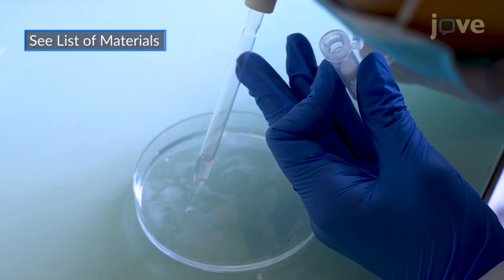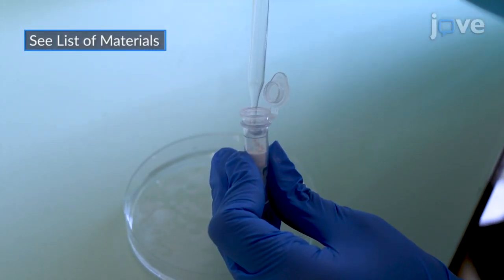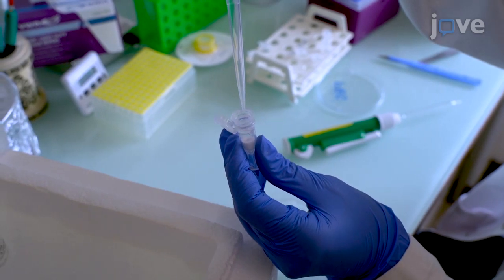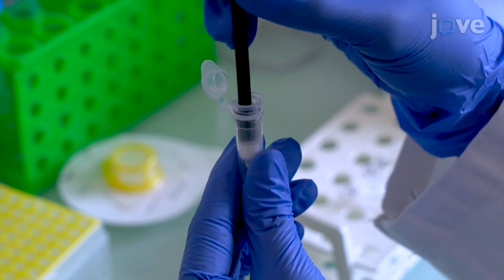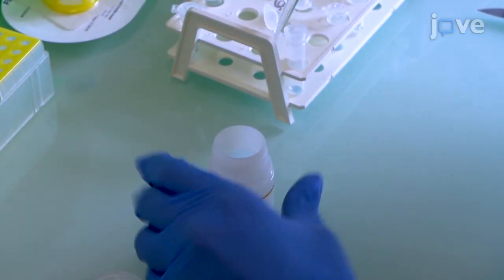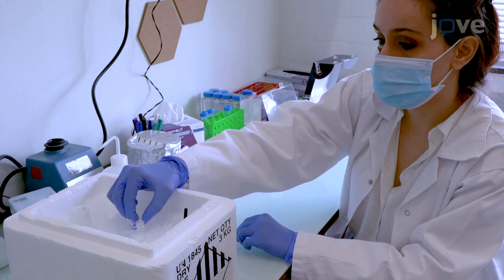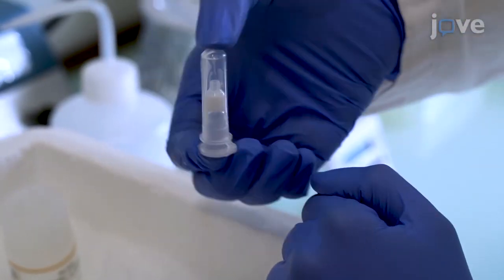To isolate single nuclei, transfer the minced tissue to the filter cartridge provided in the nuclei isolation kit and remove excess solution. Add 200 microliters of cold buffer A and grind the tissue with a plastic rod for two minutes. Add 300 microliters of cold buffer A to the filter cartridge and incubate on ice with the cap open for 10 minutes. Then cap the cartridge and re-suspend the tissue by inverting the tube five times.